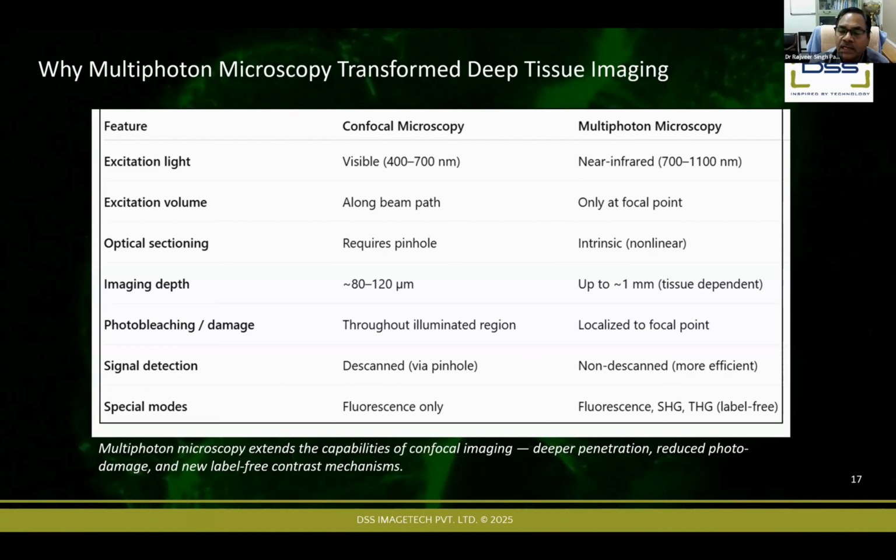Only depth we can attain. Depth of the tissue, right? Otherwise, with fluorescence, as you said, we can tag the antibody. We can use immunohistochemistry also after tagging. Yes, if we use chromogens, exactly as you said, then you might need to rely on bright field microscopy or phase contrast. And there, if you want to do optical sectioning, the ability of optical sectioning will be limited.